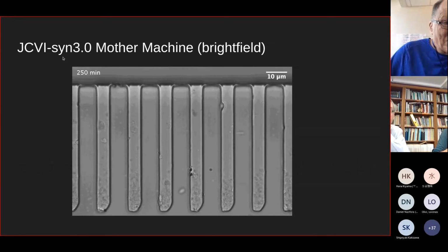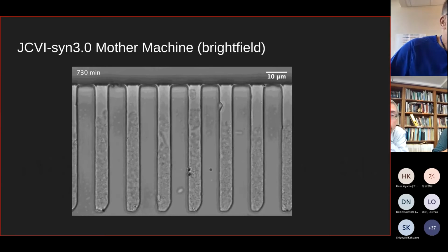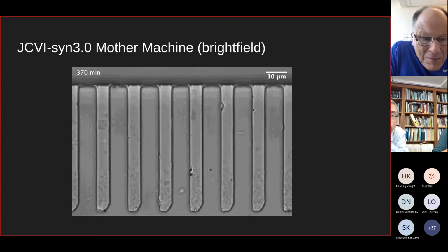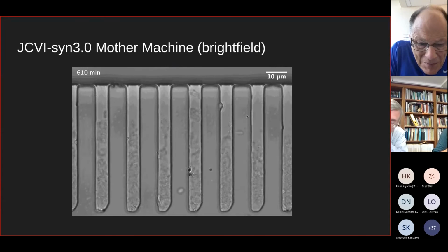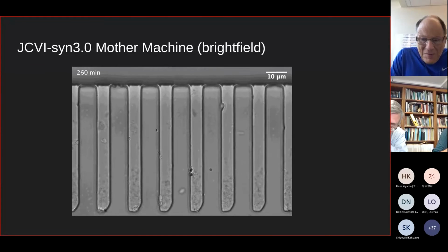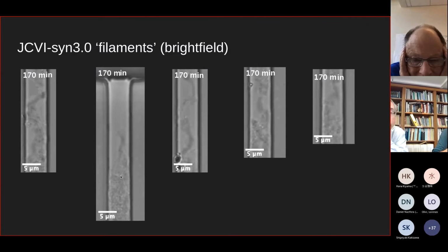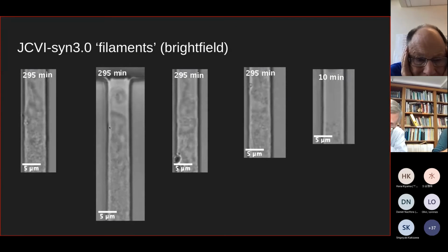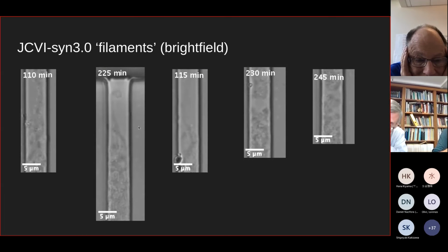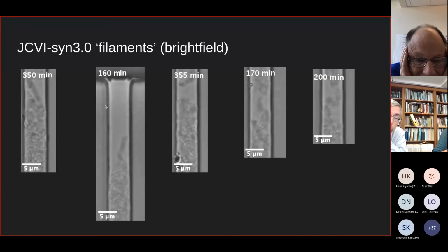The next thing we did was we grew JCVI Syn 3.0 in a very large mother machine. This one is something like 5 micrometers in width. And we got to see some of the characteristic behaviors of Syn 3.0 pretty directly. Here we see these filaments. I think we observed them in a lot of different experiments, but it's really nice to see them dynamically growing like this.